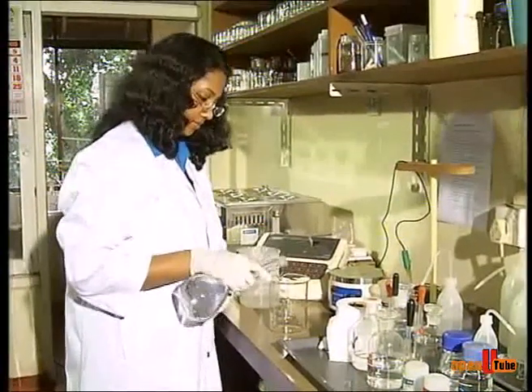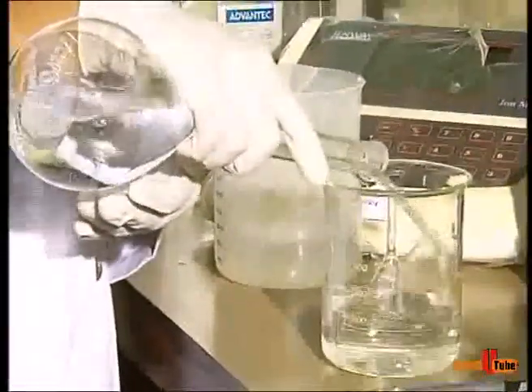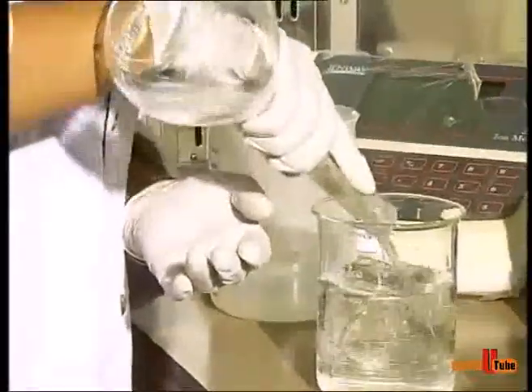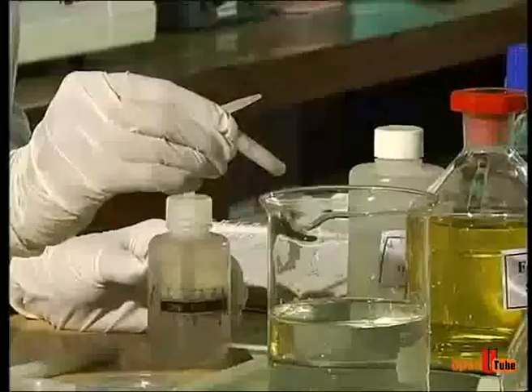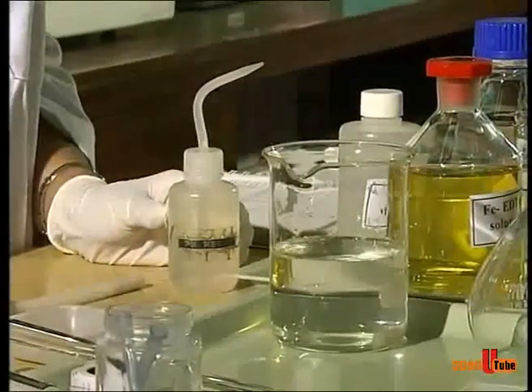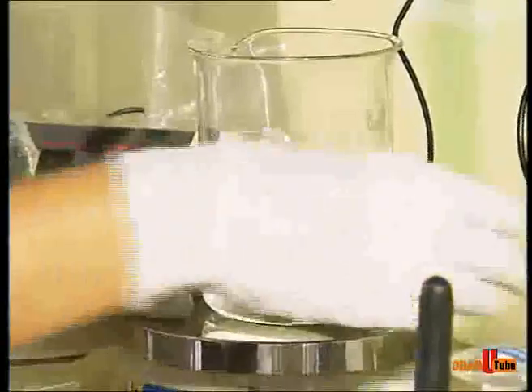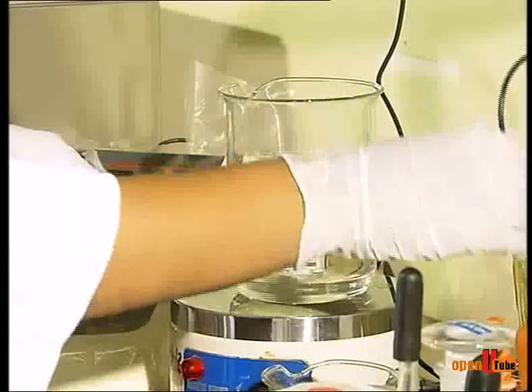It is necessary to measure the pH of the solution. The pH value of the solution needs to be adjusted to 5.8. To measure the pH, transfer the solution into a clean beaker and add a magnet into the beaker. Keep the beaker on a magnetic stirrer. Calibrate the pH meter before measuring the pH of the solution.